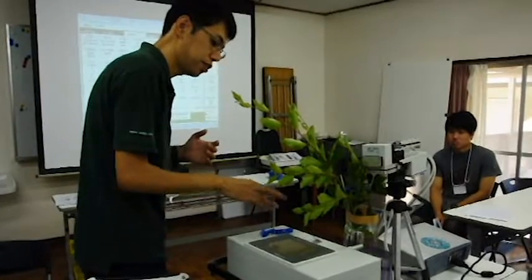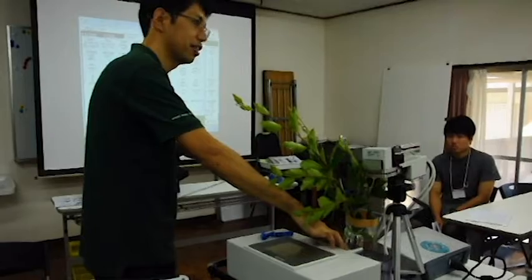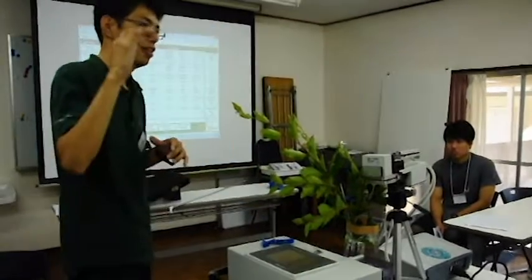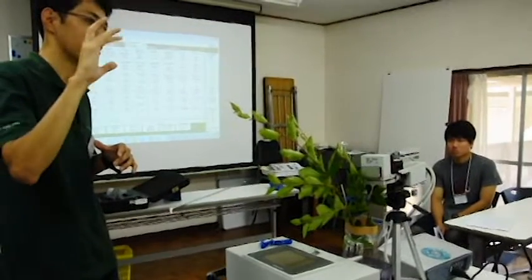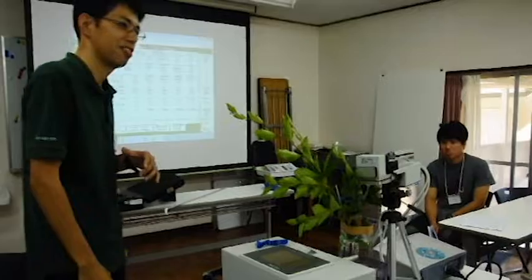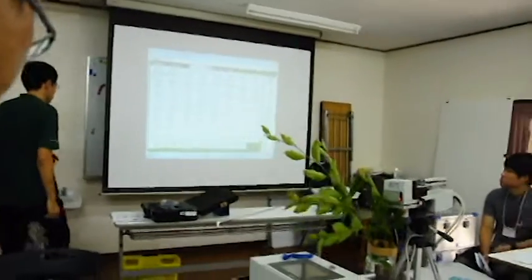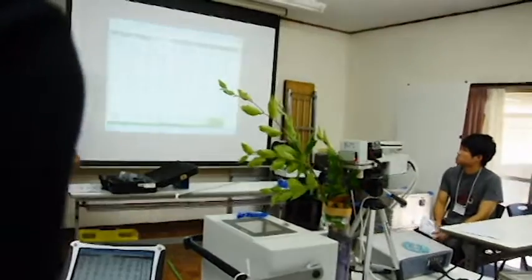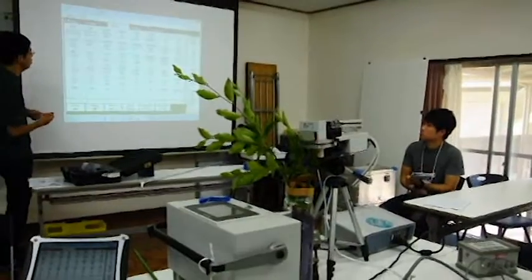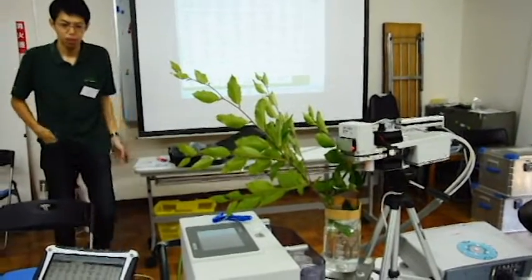At first, in this system, all of the ambient CO2 is absorbed by this chemical, and the CO2 concentration becomes zero. And then it is regulated by this cylinder. And this system also makes this, which is for reference. Okay.